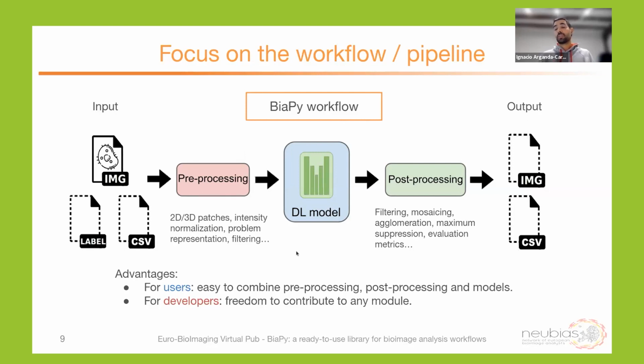And for developers, I also think it's nice to have it like this, because we have people that maybe want to contribute because they are deep learning hardcore developers and they want to contribute with just a new model for segmentation or for detection, etc. Or we have more people related to general image processing, and they want to do some general pre-processing step or some analysis, and then all the analysis can be included in the post-processing part.